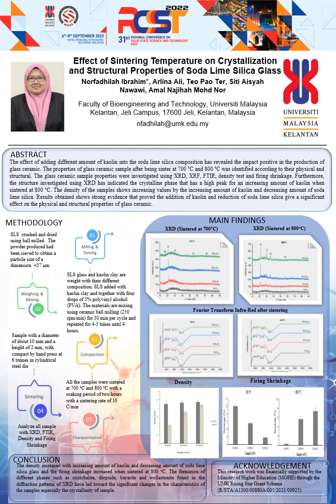Using the 10 millimeter mold. All the samples are then sintered at 700 and 800 degrees with a soaking period of 2 hours and a sintering rate of 10 degrees Celsius, and then we analyze them after that.